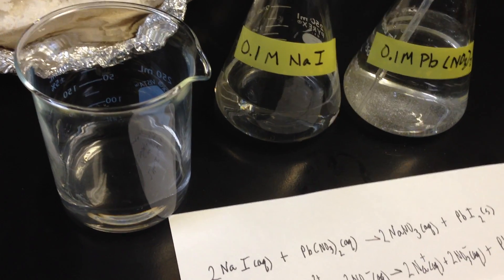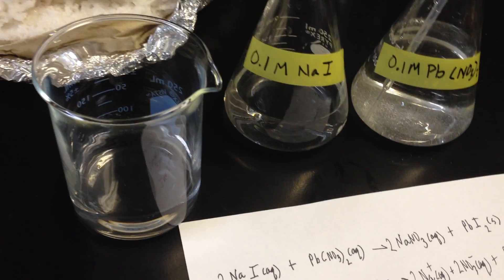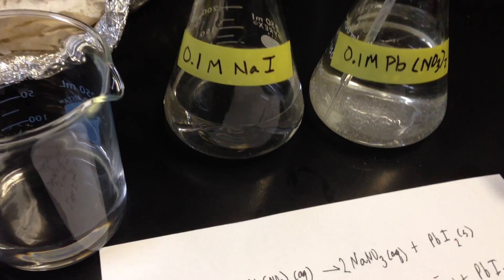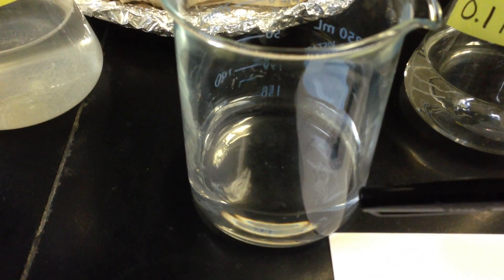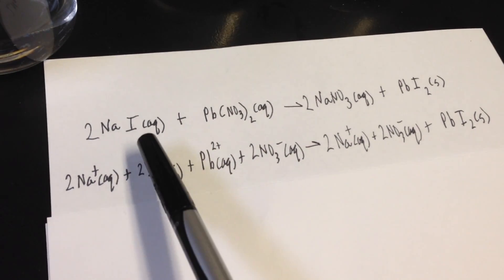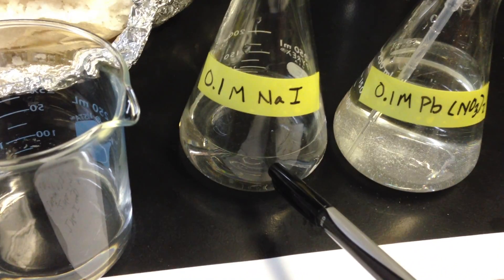I'm going to show you guys a couple of double replacement precipitation reactions. So we have sodium iodide in solution, and lead nitrate in solution. I place some sodium iodide in this beaker, and we're going to react sodium iodide, AQ means it's dissolved in water, which you can see it is.